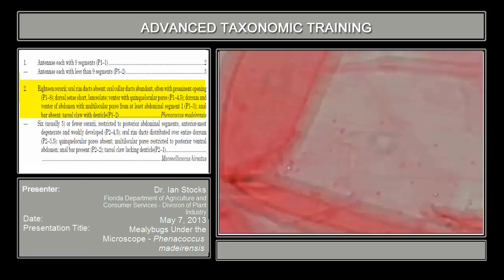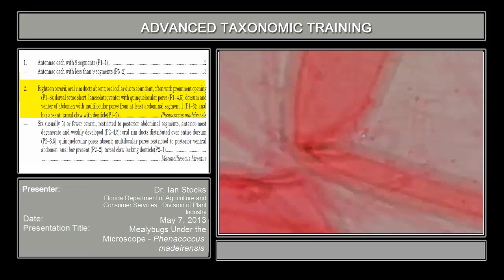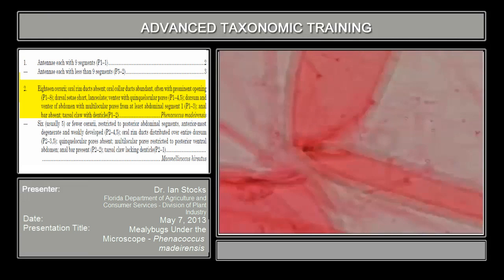What's going to help me decide that that's the structure I'm looking for is not just the fact that I've got the big socket there, okay, here, but also that I've got a few trilocular pores surrounding it too, okay? Other setae, just the standard dorsal setae type that we've looked at, around here for instance, don't have any particular concentration of trilocular pores. And the flagellate setae, where they're found, don't either.